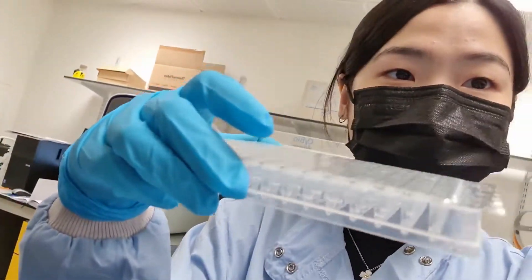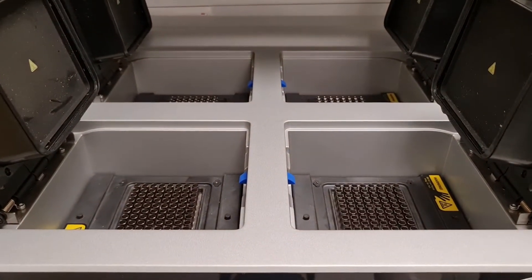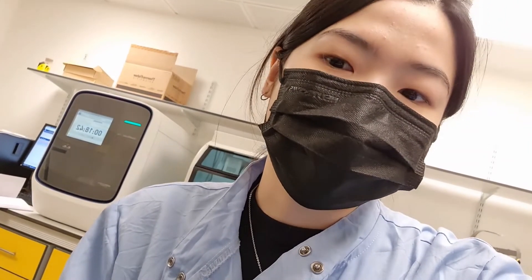Here I've got my samples in my 96-well plate and I'll be putting them into the PCR machine. I can fit a maximum of 4 plates into one machine. PCR stands for polymerase chain reaction. The reaction normally consists of your template DNA — which you want to amplify — then primers, a forward and reverse primer, a DNA polymerase (in this case I'm using Long Amp Taq), and finally some water to dilute it down.